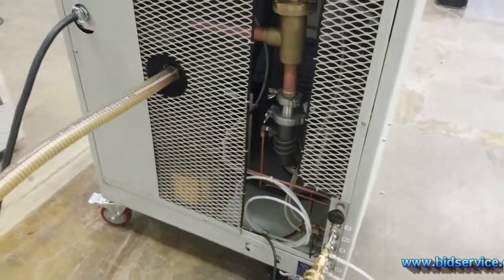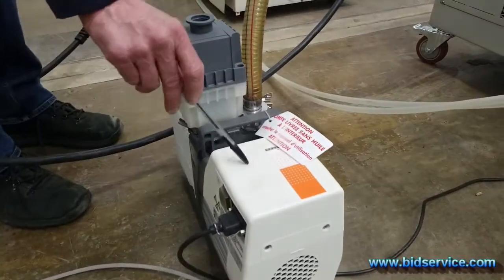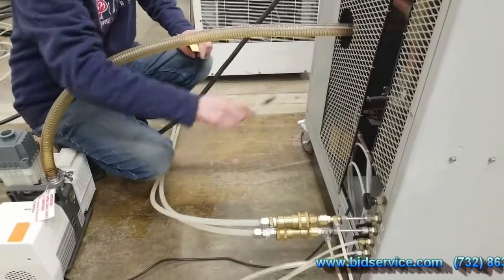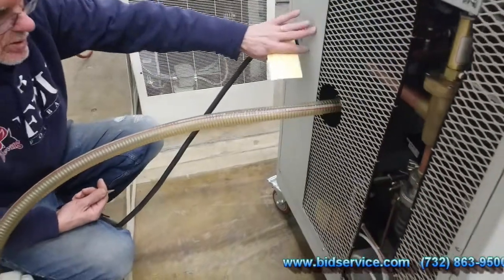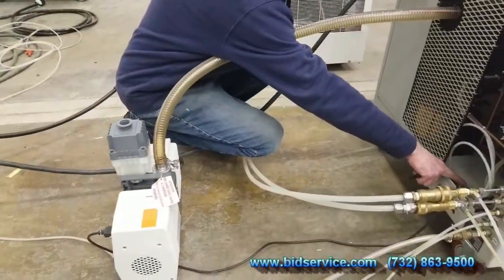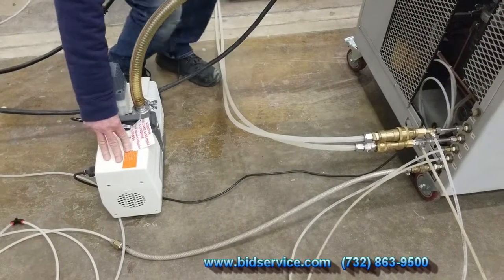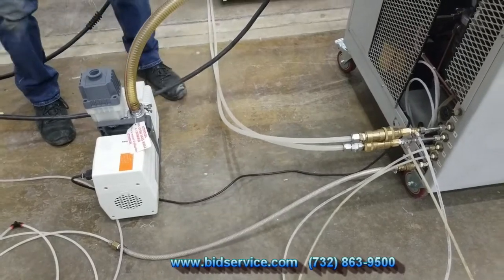We have our vacuum pump attached here. This pump requires 208 single phase; there is an outlet in the back to plug it in internally. When I ship it I'll connect the wire and ship the pump separately. We take the oil out of the pump — make sure you add the oil back before using it. Put a tag on it to remind you.